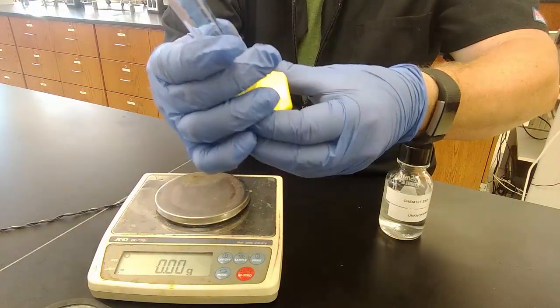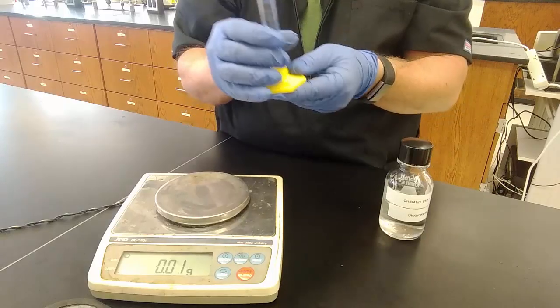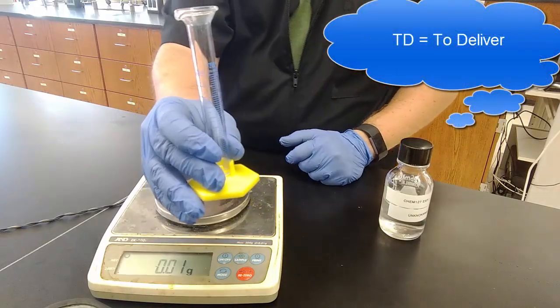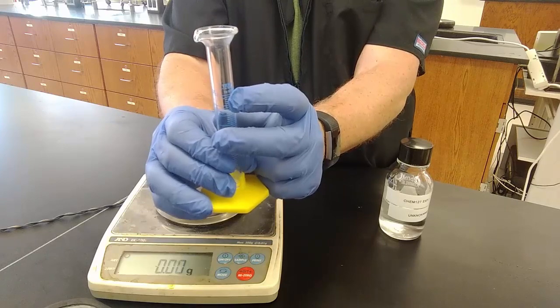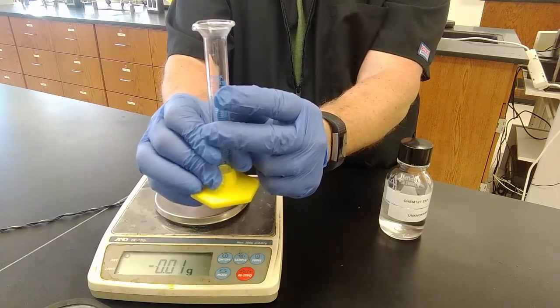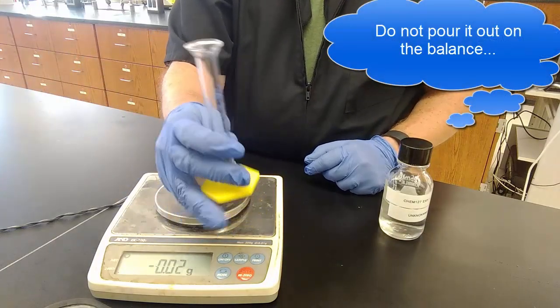Most graduated cylinders, like the last one we saw in part 1, are TC. They contain a certain volume. And this graduated cylinder is marked TD for to deliver, meaning if I fill it to the exact 10.00 line, and more on that in a moment, then I can pour out exactly 10.00 milliliters.